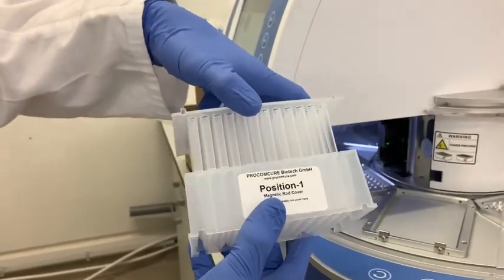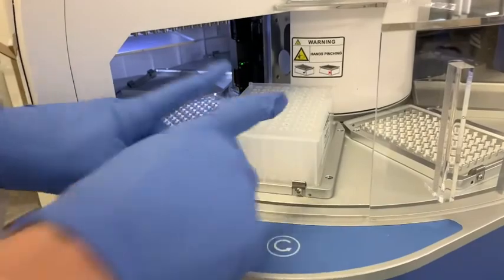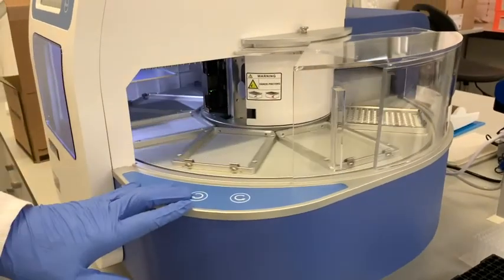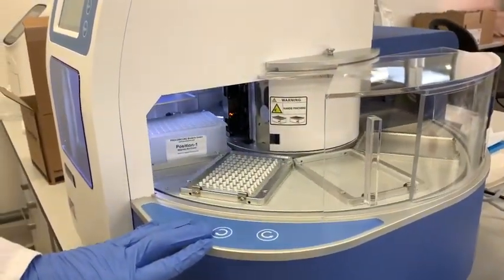Position 1 well goes to position 1 in the machine. Click on the rotation button to bring position 1 to the center. Please make sure that it is always at position 1 when starting the extractor.